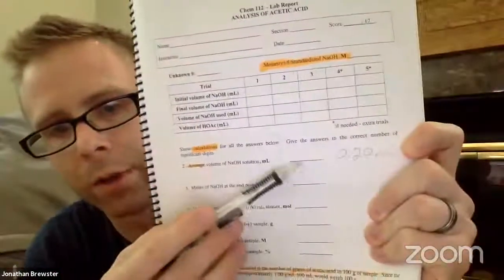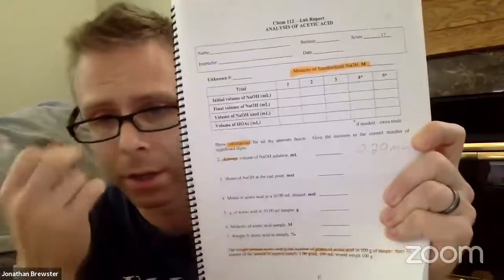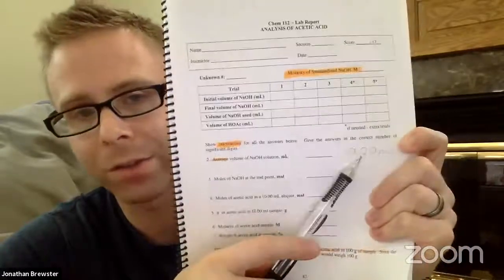So essentially, for this part here, you're going to end up with an average. You'll take your different runs and you'll average the volume of sodium hydroxide that you used. And the standard deviation is one thing, or just make sure that all the runs are within this amount of each other. And if all 3 are within that amount of each other, then you can move on. And most likely, if it's your first time doing it, it'll be your first run that is probably the worst, because after that, you sort of know about how much you need. And I'll give some tips for that when we get there.